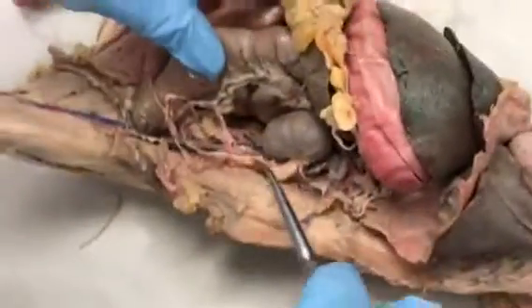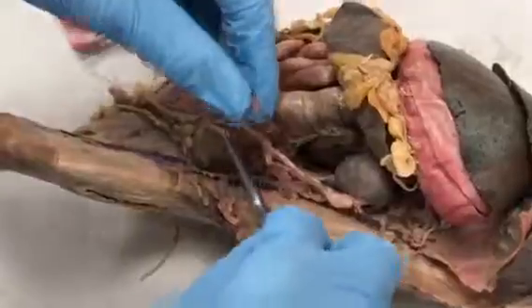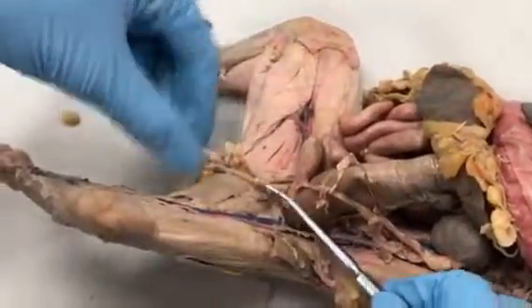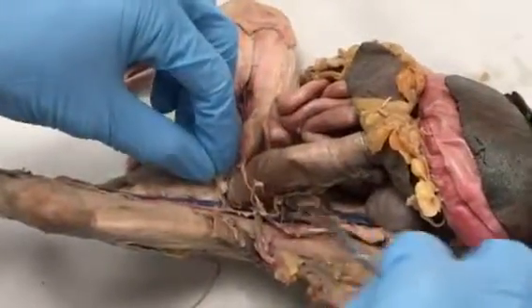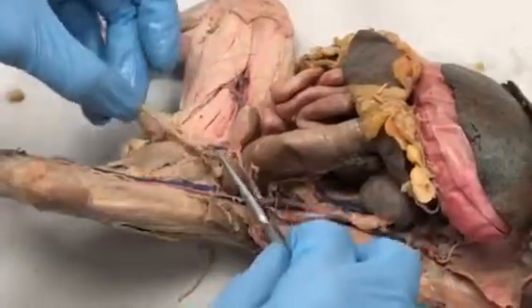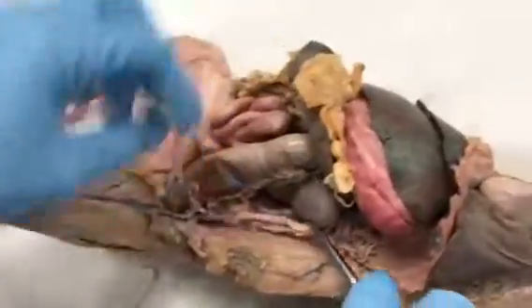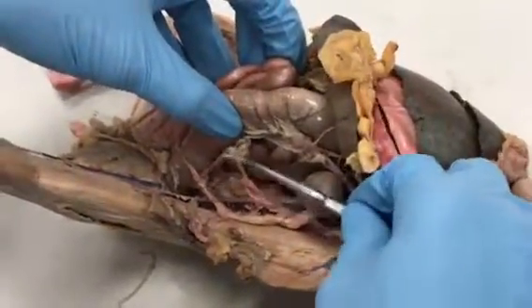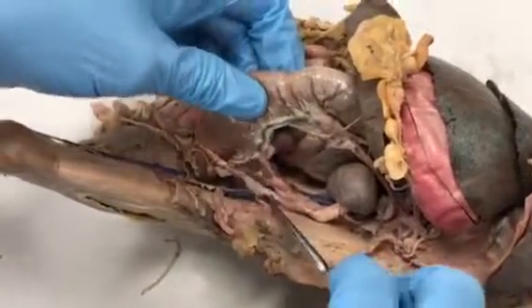Now in the male cat, over here, the gonadal artery is going to come off about the same place, but it's going to turn and go down into the spermatic cord here, and here it is. Here's where it goes. This is the left gonadal artery, and it comes off here, and it kind of got cut between here and here, but it eventually goes into the spermatic cord and goes down to the testicle. All right, so then continuing on down, we have the posterior mesenteric artery right here, and that's going to the mesenteries of the large intestine.